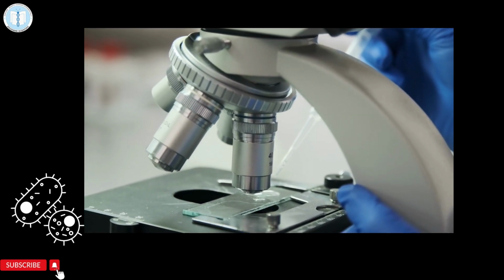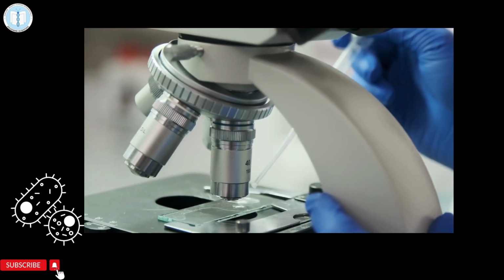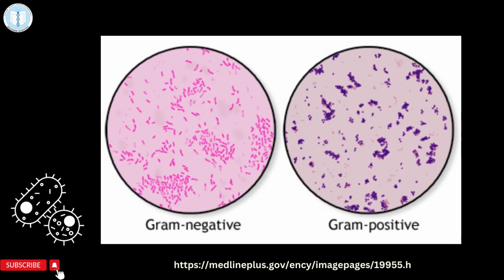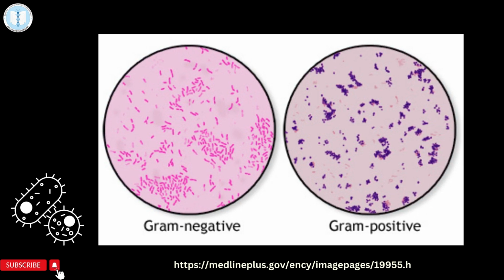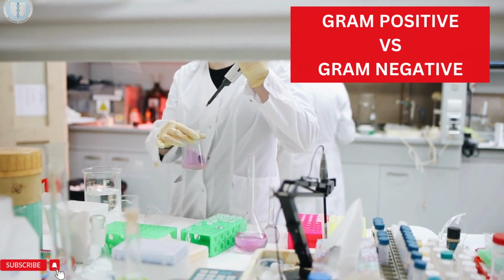In contrast, gram negative peptidoglycan is very thin, not as highly cross linked, and has larger pores. Alcohol treatment also may extract enough lipid from the gram negative outer membrane to increase its porosity further. For these reasons, alcohol more readily removes the purple crystal violet iodine complex from gram negative bacteria. Thus, gram negative bacteria are then easily stained red or pink by the counterstain safranin.